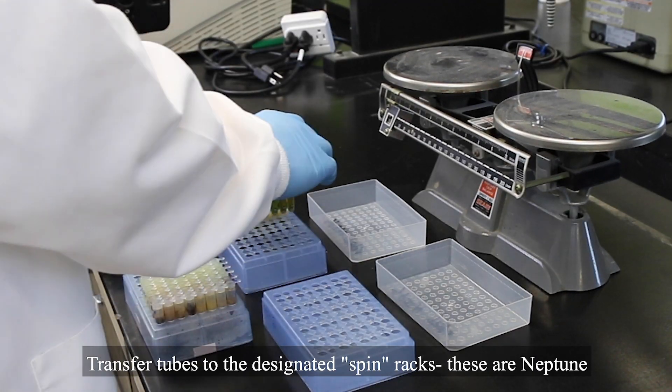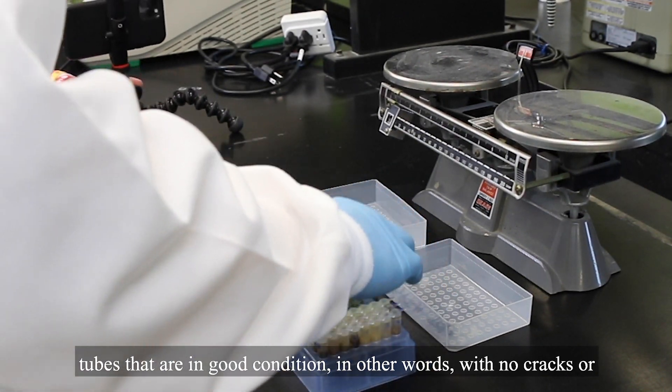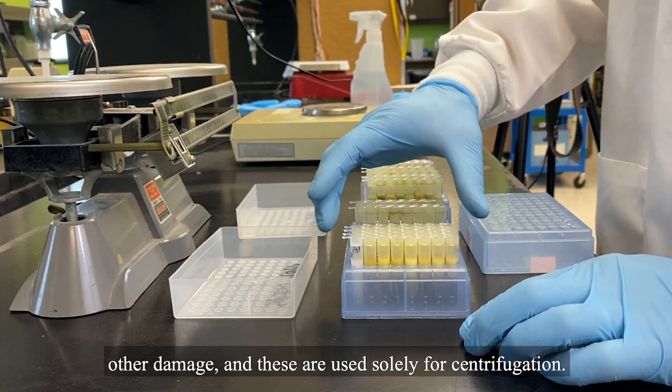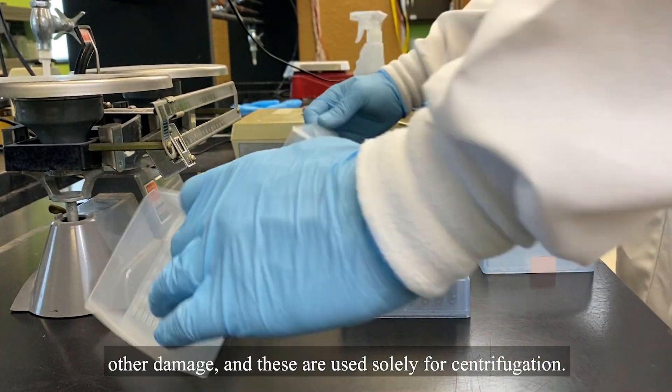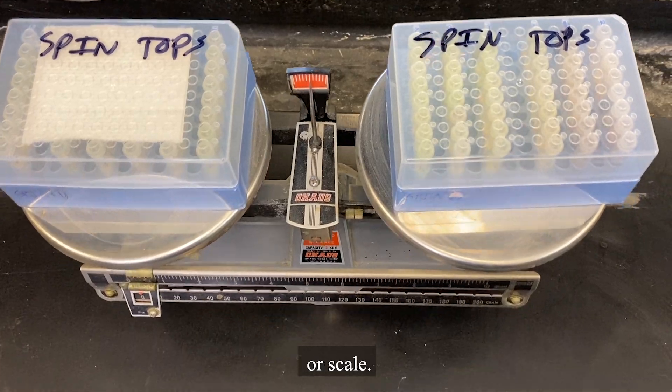Transfer tubes to the designated spin racks. These are Neptune tubes that are in good condition, in other words, with no cracks or other damage, and these are used solely for centrifugation.